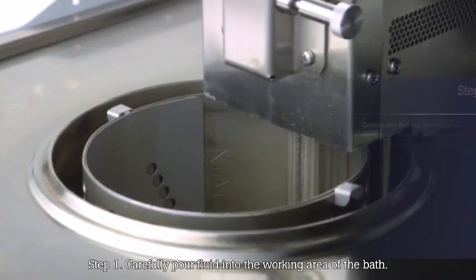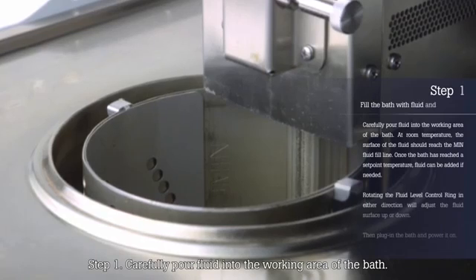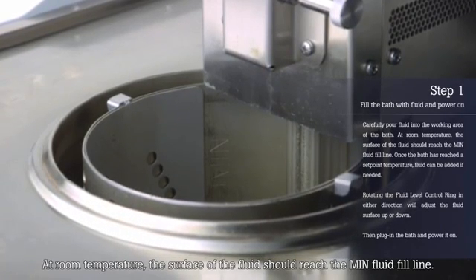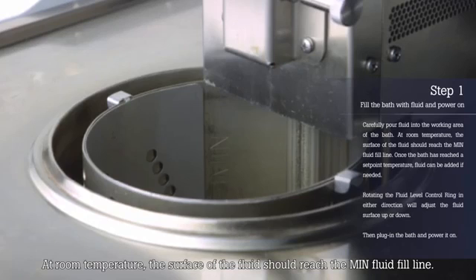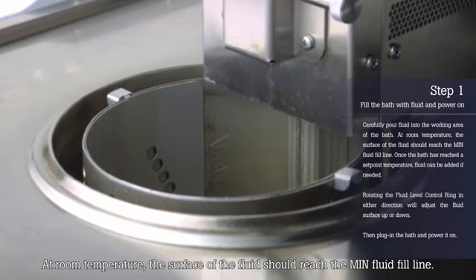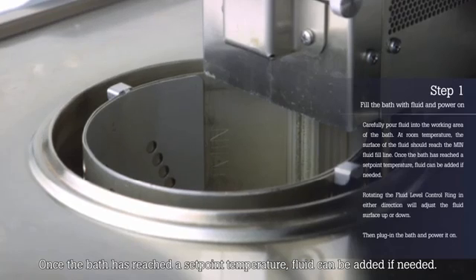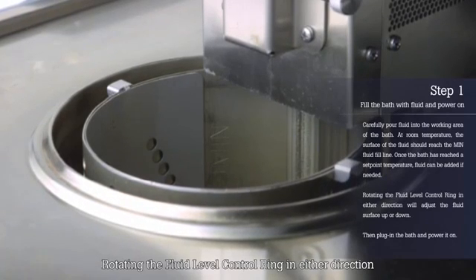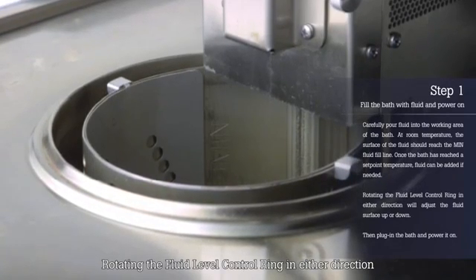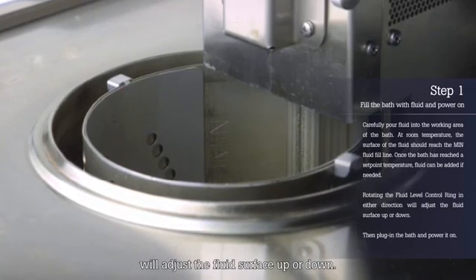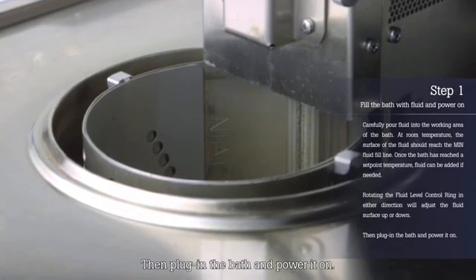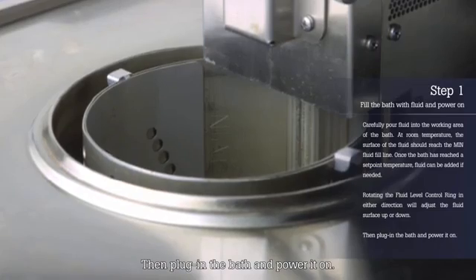Step 1: Carefully pour fluid into the working area of the bath. At room temperature, the surface of the fluid should reach the min-fluid fill line. Once the bath has reached a set point temperature, fluid can be added if needed. Rotating the fluid level control ring in either direction will adjust the fluid surface up or down. Then, plug in the bath and power it on.